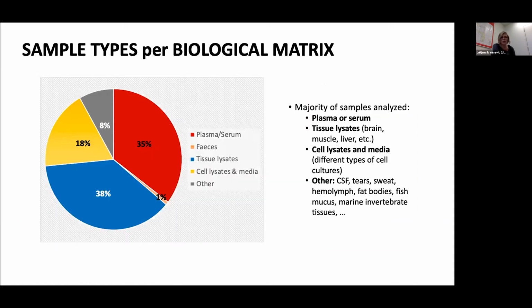To give you an idea about the sample types we can analyze, there are no limits in terms of biological matrices. But based on statistics from the last 3 years since we were fully functional, we mainly analyze different types of biofluids, including plasma, serum, urine, and CSF, and a lot of tissue extracts and cell lysates, including bacterial pellets and yeast extracts.